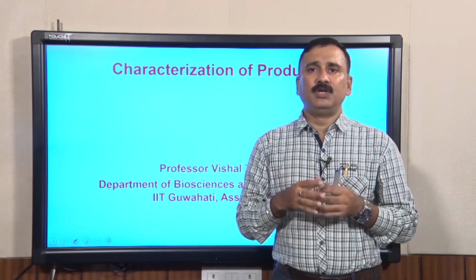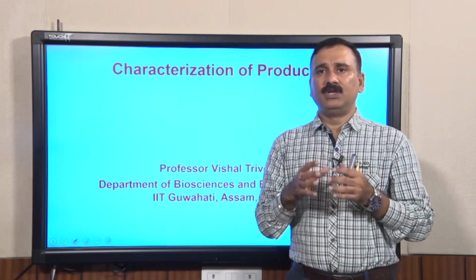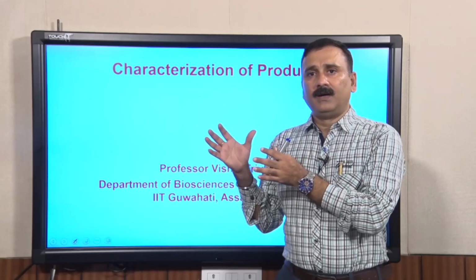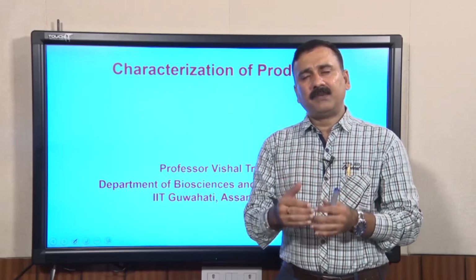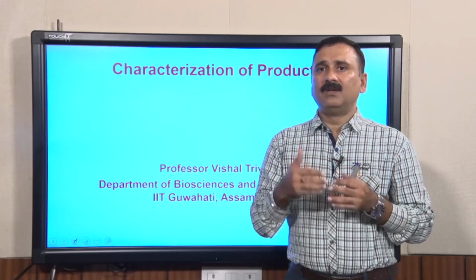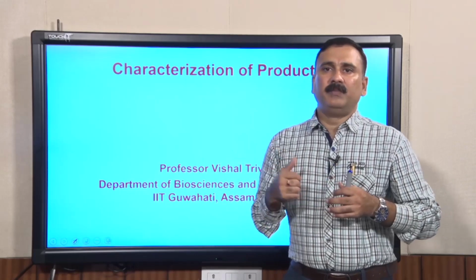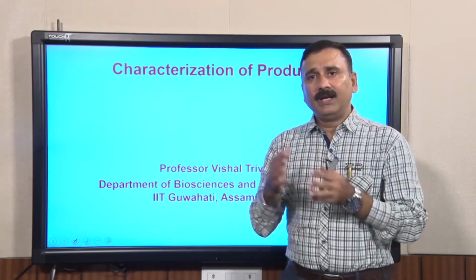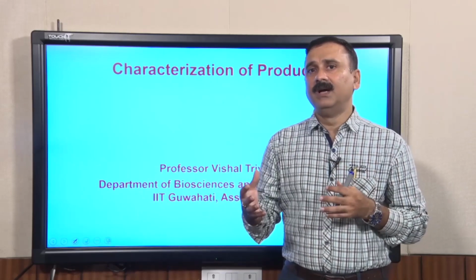Continuing our discussion about UV visible spectroscopy, in today's lecture we are initially going to discuss how UV spectroscopy can be used to know whether there are structural changes happening in the molecule or not, and subsequently we will discuss IR spectroscopy to characterize the functional groups present on the molecule. So, let us start with UV visible spectroscopy and how the absorption spectra is modulated when you have different types of changes in the molecule.